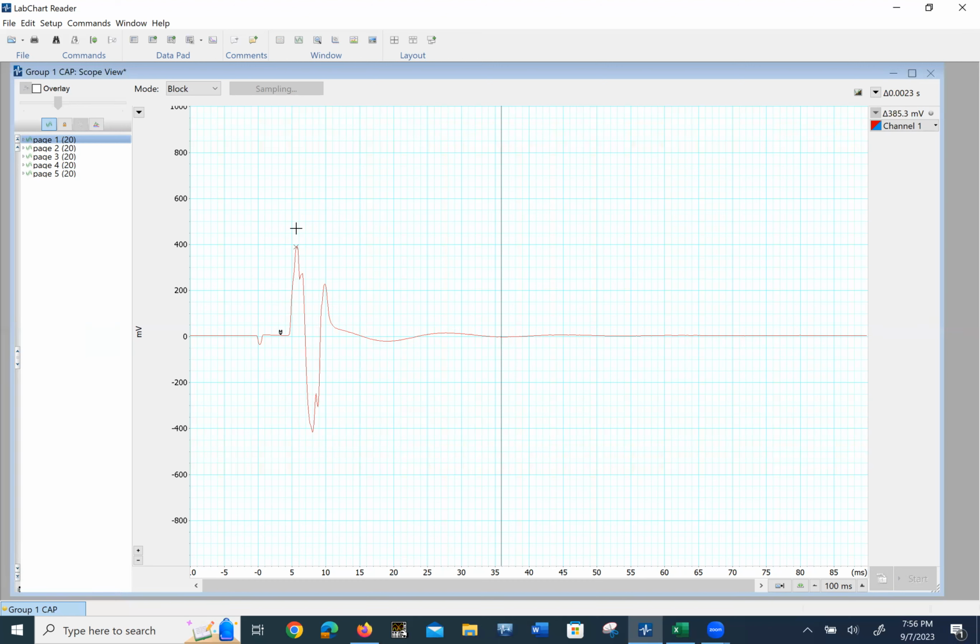Okay, and now what you could do is take this marker away, click it over here, see where it clicked over here, and now just use your cursor. You could either pick some value that you want, like where it starts to rise, or maybe that peak value again. Let's just pick this peak. Now, what do we have up here? We have a time.